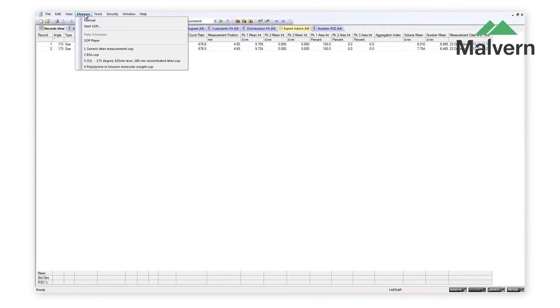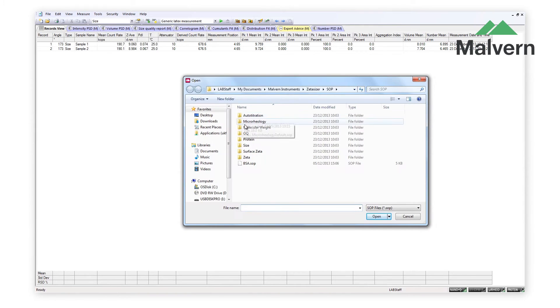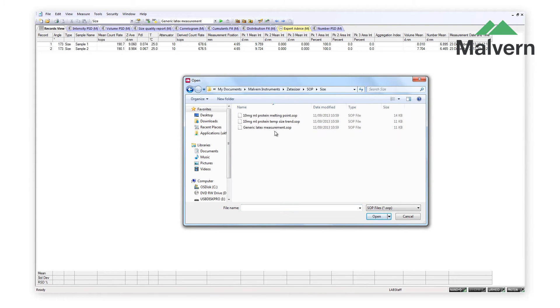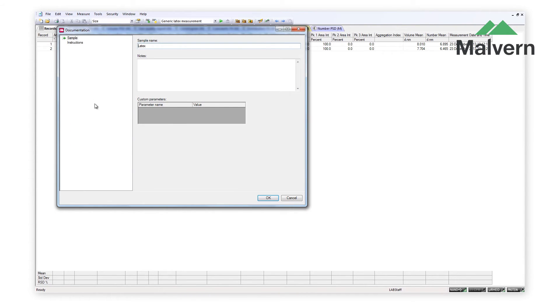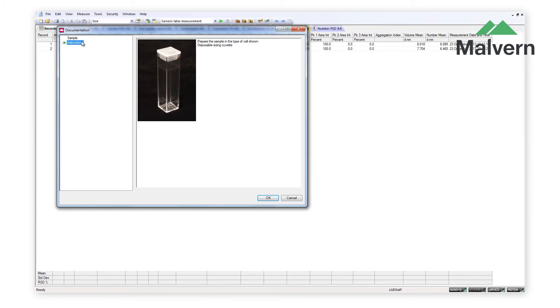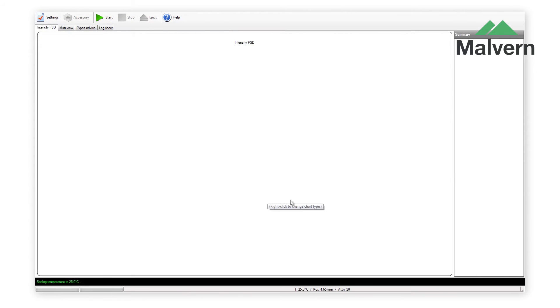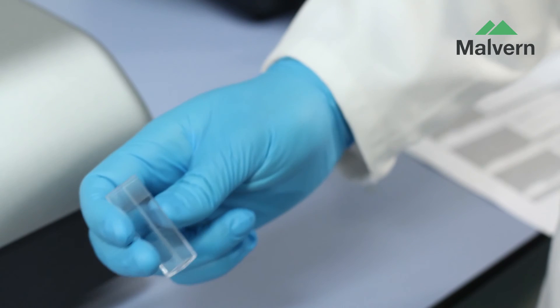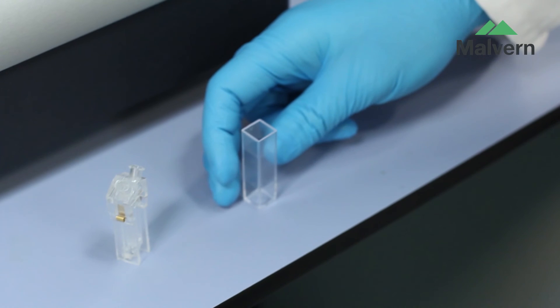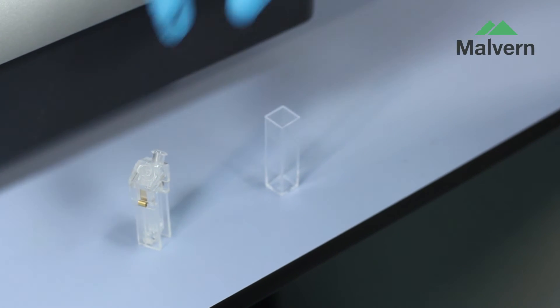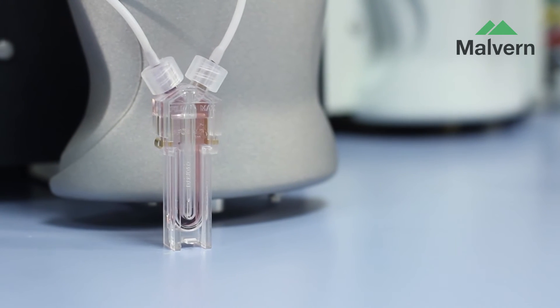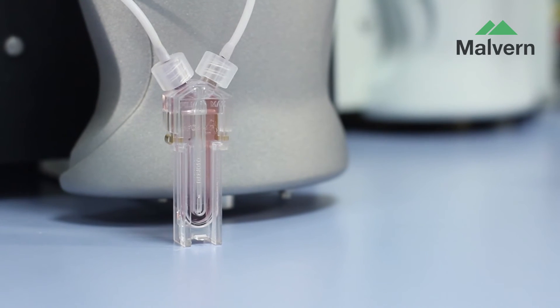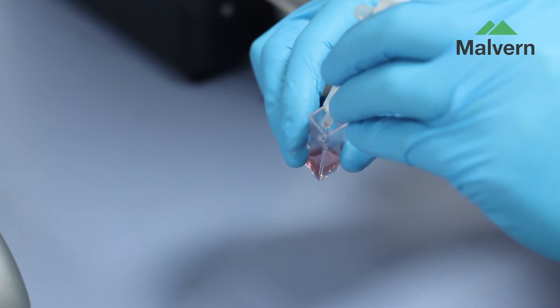Sample measurements on the ZetaSizer Nano are simple and can be started after only two clicks of the mouse. Standard operating procedures are provided in the software, which preset all of the measurement conditions and also show you which measurement cell to use. Size measurements are performed in disposable plastic cuvettes; however, zeta potential measurements are more commonly made in disposable folded capillary cells.